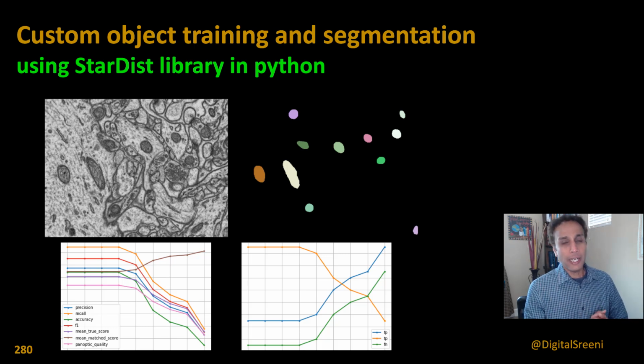In this video, I am going to talk about how you can use your own images and masks to train a StarDist model for instance segmentation. In other words, for object segmentation. Why did I put quotes around instance? Because oftentimes you think I'm talking about Mask-RCNN or something else, even though the end result here is going to be exactly the same.